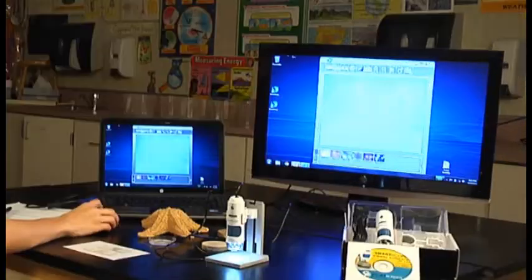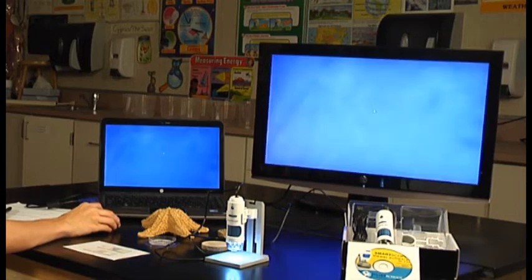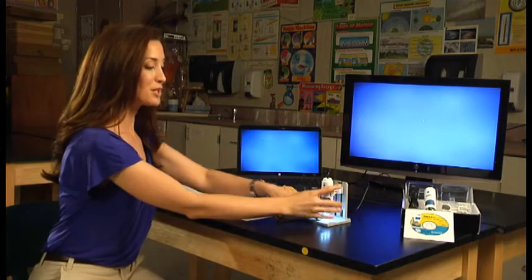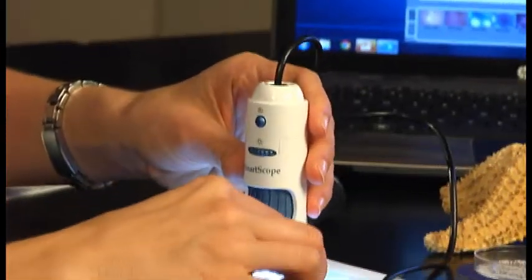Let's go ahead and get started. First, just double click on the image and that'll bring it into full screen mode. As I mentioned, you can use the SmartScope like a traditional microscope. So let's start by taking a look at a bee wing slide.